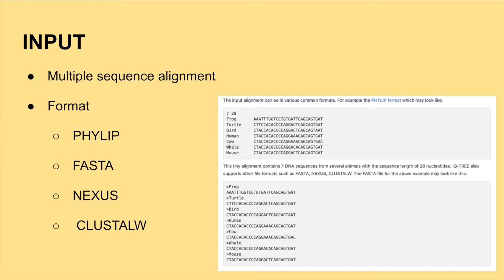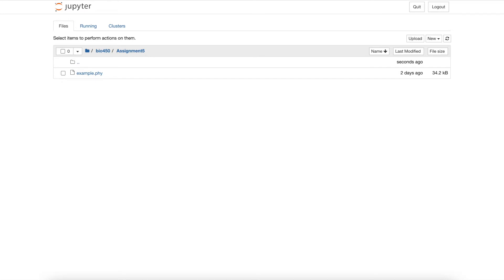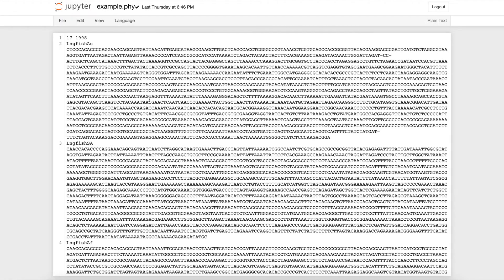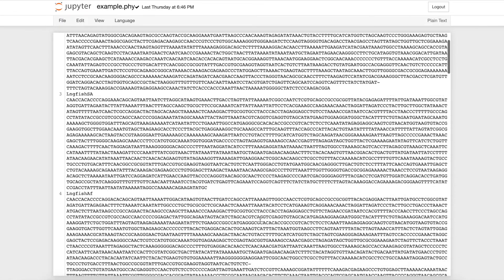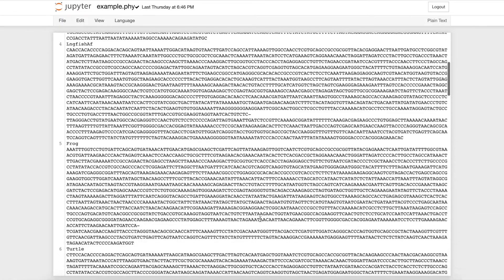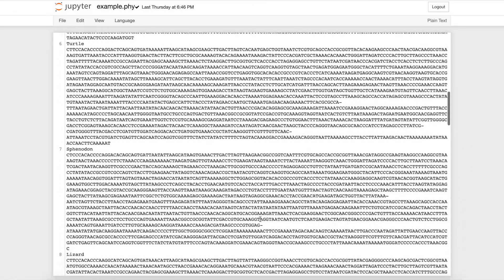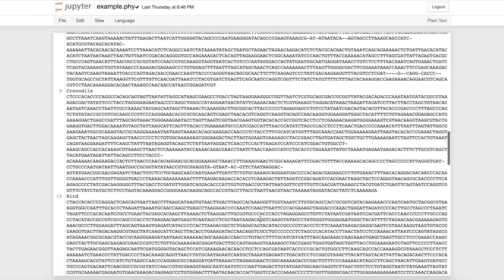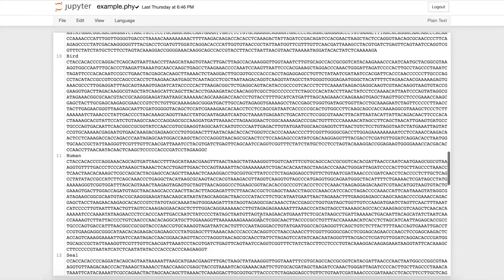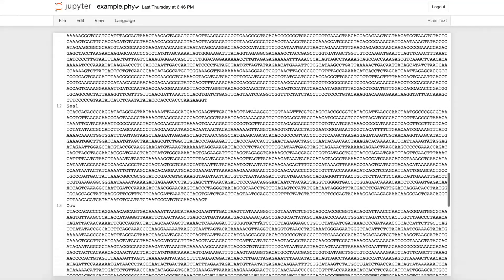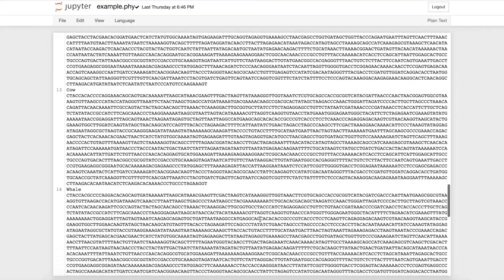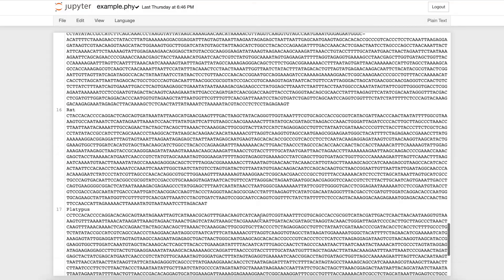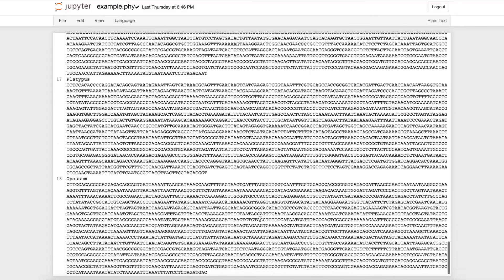IQ-Tree 2 user manual provides a file of example data, which I will use to demonstrate input, running, and output of IQ-Tree 2. This file, example.phy, contains a multiple sequence alignment in the PHYLIP format as you can see here. This file contains 17 organisms in which this software will organize into a phylogenetic tree for us. We will refer to this file for the demo.